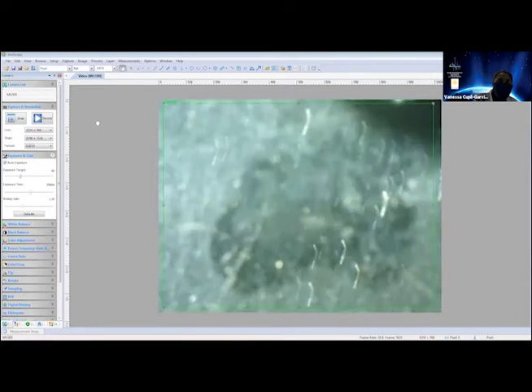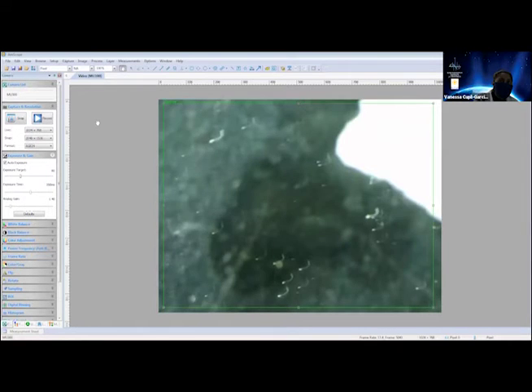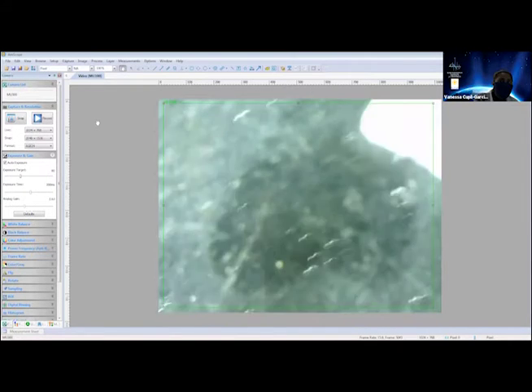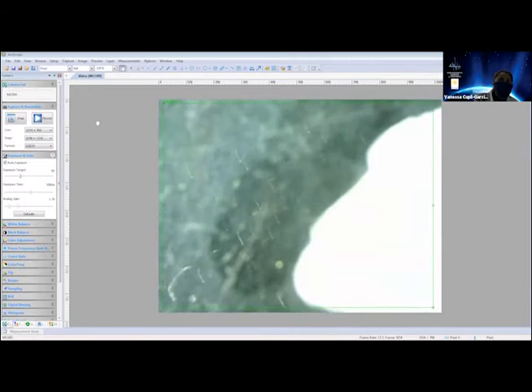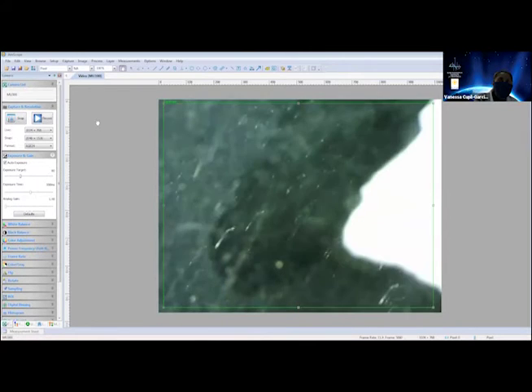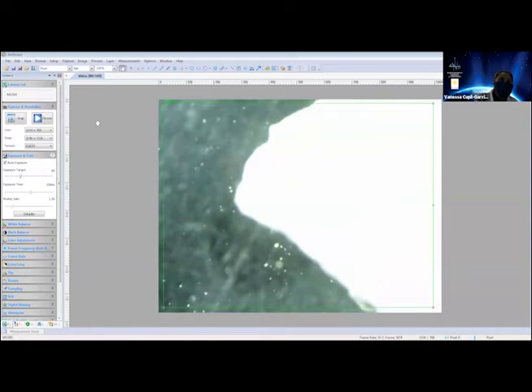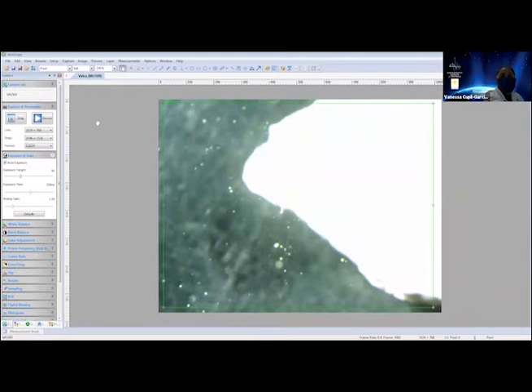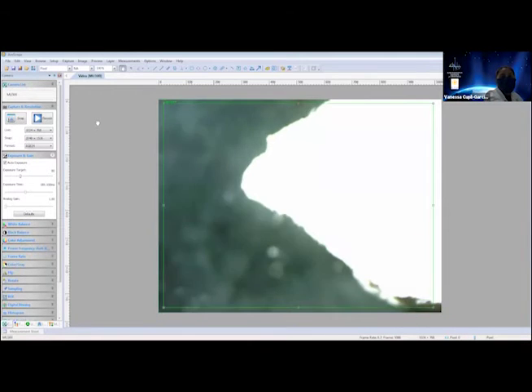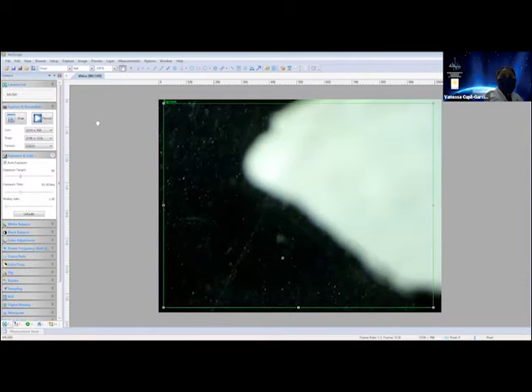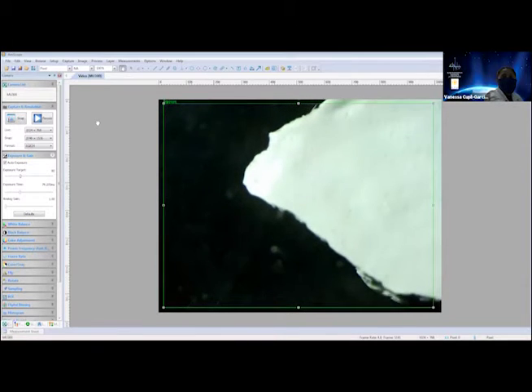Similarly, if we look at our second sample. Right now I'm moving it manually with my hand. So this is the piece of wall. And again, I have to adjust the focus by moving the objective. And on this piece of wall, we can see it's been painted the color white, and we can see some of the grains and texture of the wall.